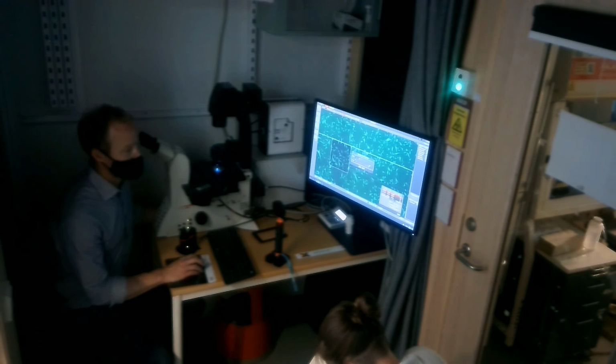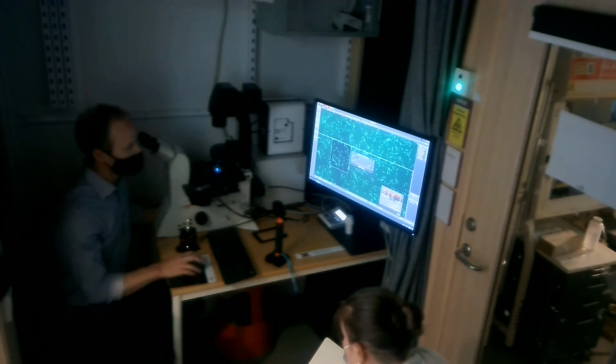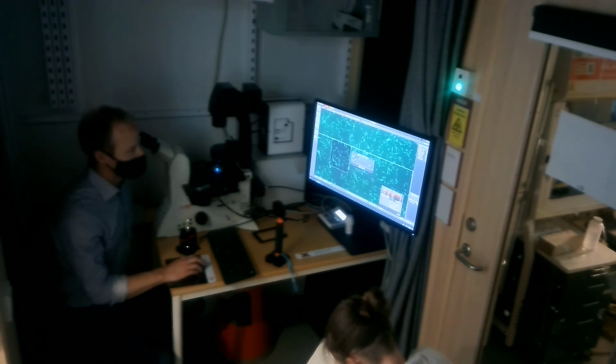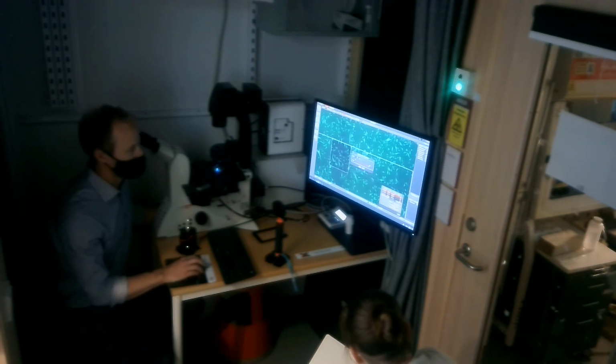What this is actually saying is how many steps it's gonna do over the range of 80 microns. Now it was set all the way to here, so it basically did 2, so that will not work for especially a sample like this that is so thin. Also 80 microns is probably more than I would need. But I would play around with this to get a better fit.